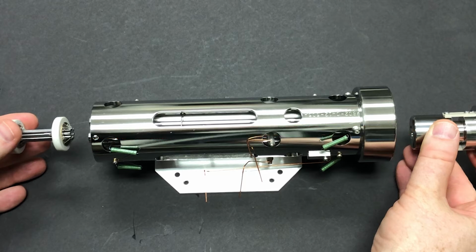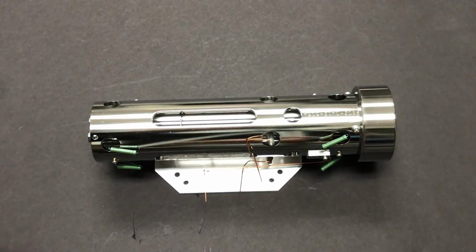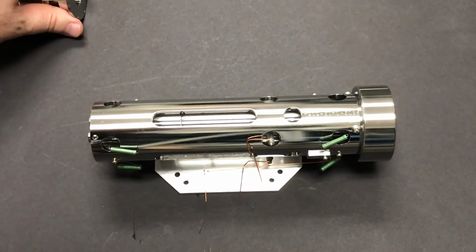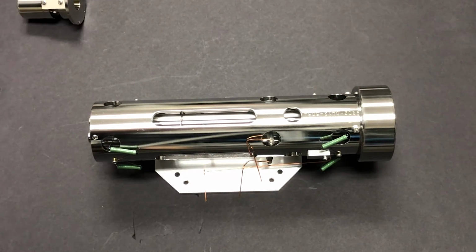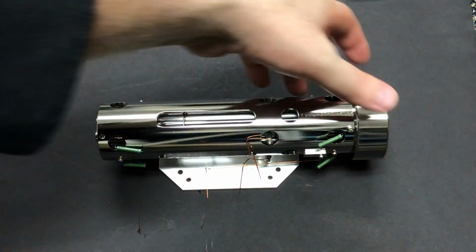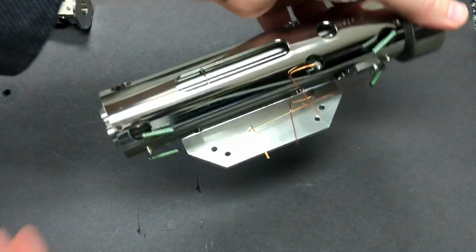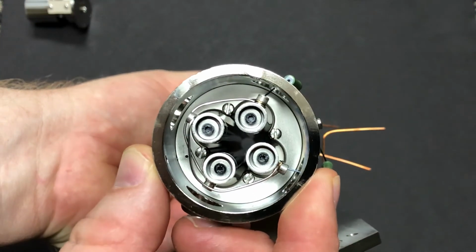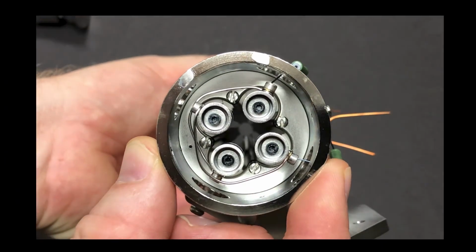It has to spread out the ions so that they hit the detector one at a time in an organized way, and we're able to discern what mass to charge actually hit the detector. So remember, the detector cannot tell what ion hit it. That's the job of the quadrupole mass filter. Let's get more into how this guy works.